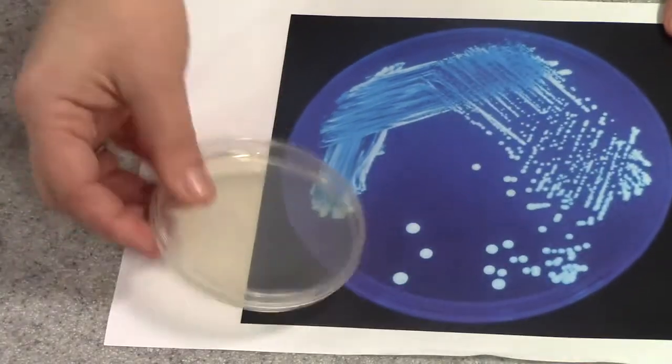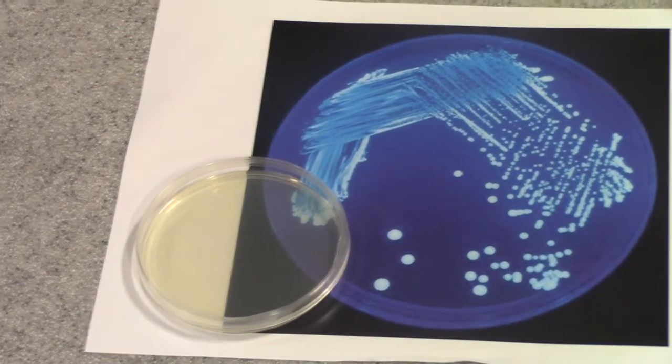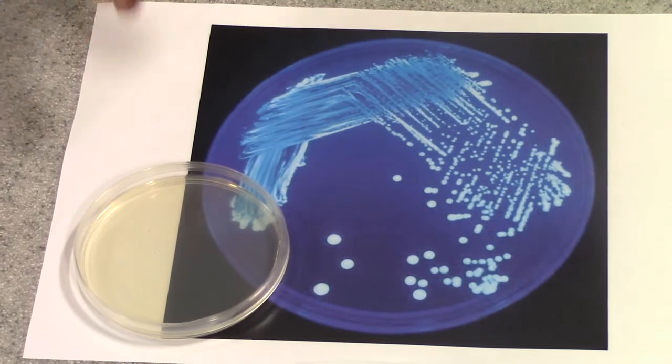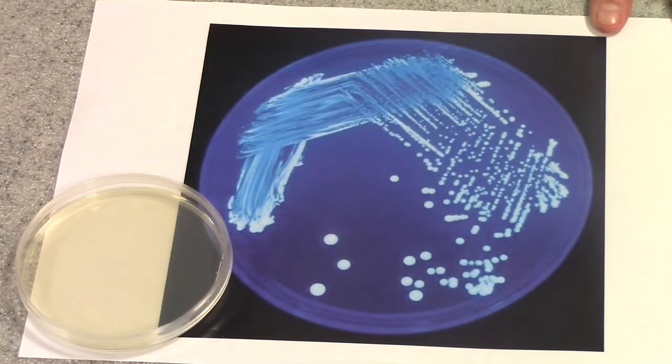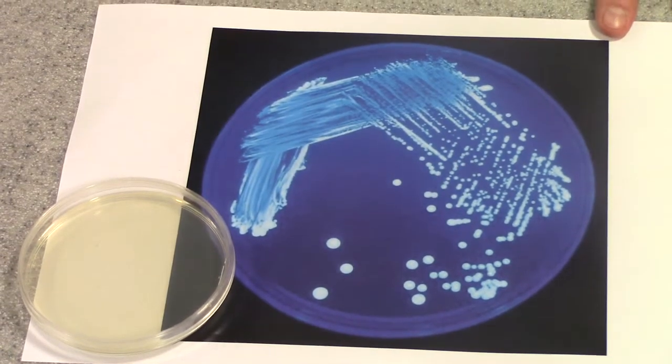The agar petri dish should now be incubated in an oven at 20 degrees for around 48 hours, and after that time, it should be possible to observe the individual colonies, which can help you to identify the bacteria you're looking at.